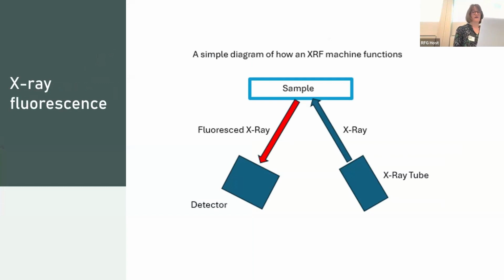Essentially, XRF involves firing a very controlled amount of X-rays at the object or sample. I have a very blocky diagram to have a look at, so you can see what the detector sort of looks like, which will then penetrate the surface of the object/sample. The X-rays then donate energy to the atoms, which then displaces the electrons from the object out of place. This then leads to the atoms giving off their own X-rays. This is the fluorescence in the name, which the equipment then detects.